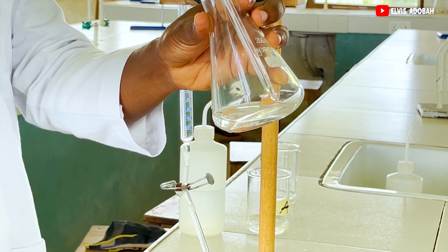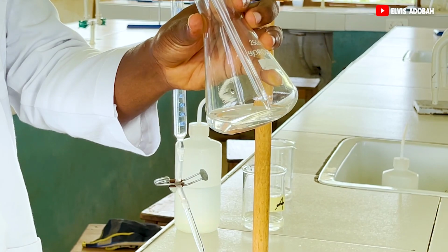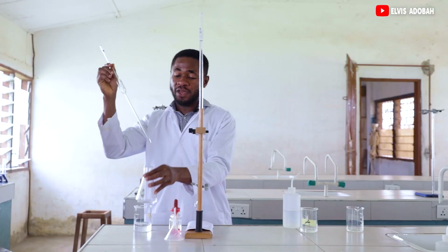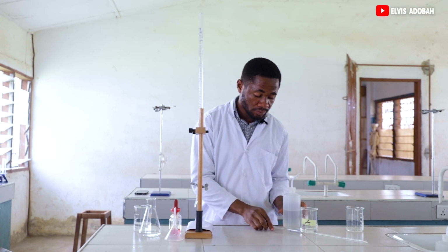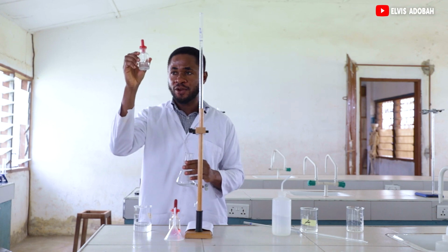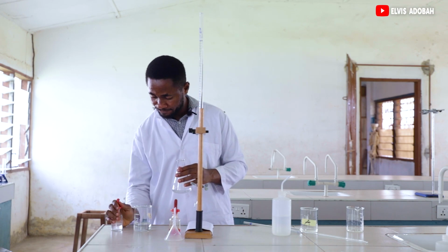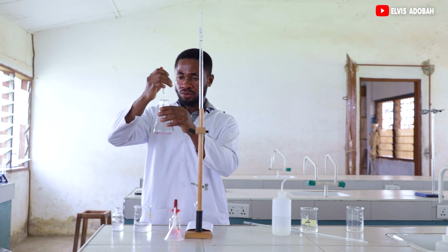Then we tap the base of the conical flask once or twice with the tip of the pipette. Then we add our 2 to 3 drops of our phenolphthalein indicator. 1, 2, 3.